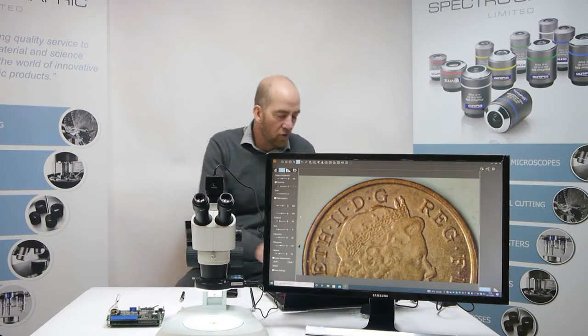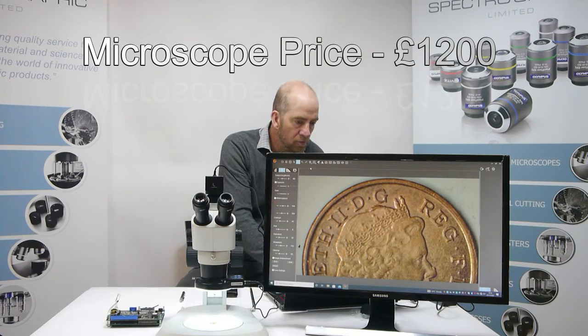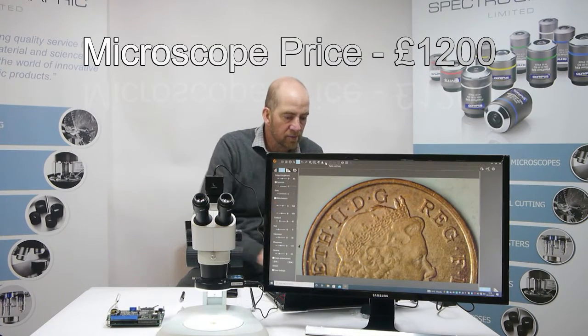And this is great for image capture and such. So we can just capture an image like this. It should appear in the browser side.